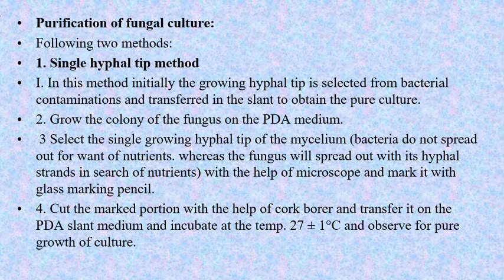Purification of fungal culture. Okay, these three methods we have studied, that is purification of bacterial culture. Now purification of fungal culture, by the following two methods. First method, single hyphal tip method. In this method, an actively growing hyphal tip is selected from the bacterial contamination and transferred in a slant to obtain pure culture. Grow the colony of fungus on the PDA medium. Select the single growing hyphal tip of the mycelia.